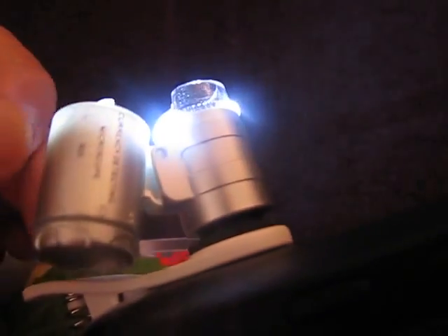Here's a leaf — let's check it. You can also play with the orientation of the light to get better images.